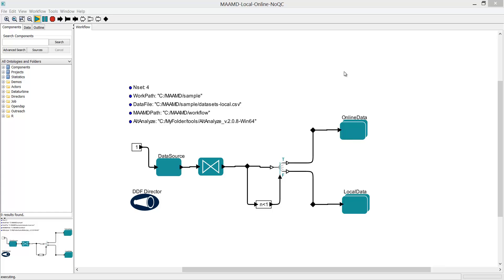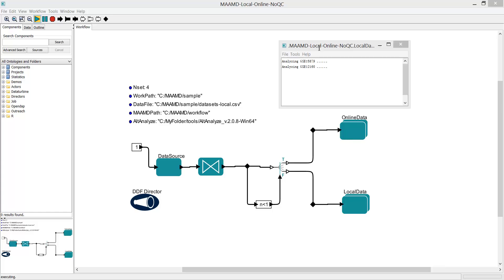Once MAMD finishes the meta-analysis of first dataset, let's switch to the second dataset and repeat the same steps.